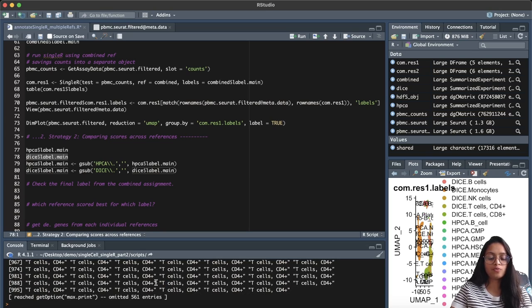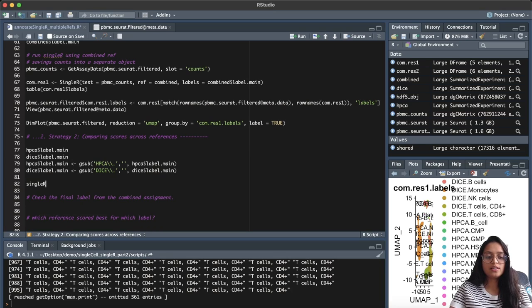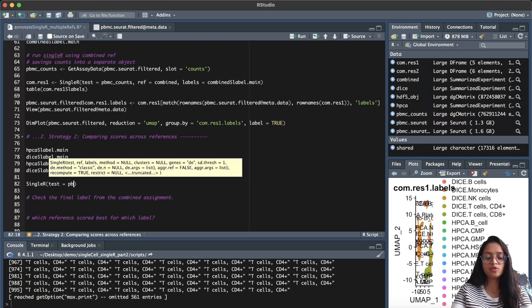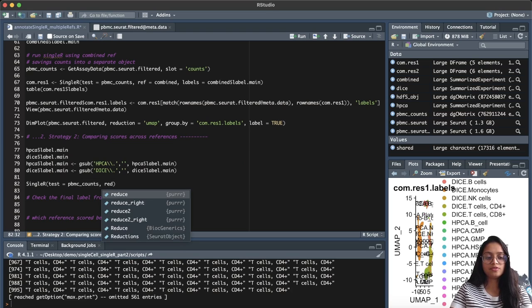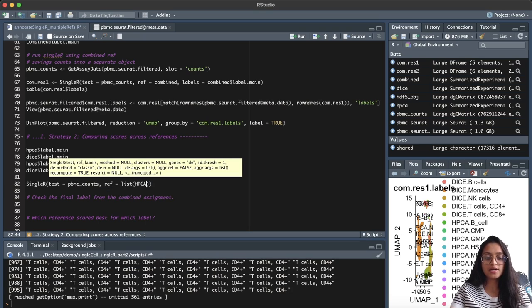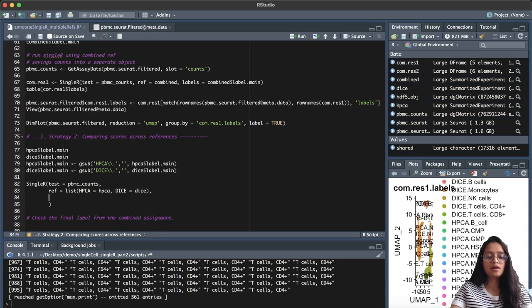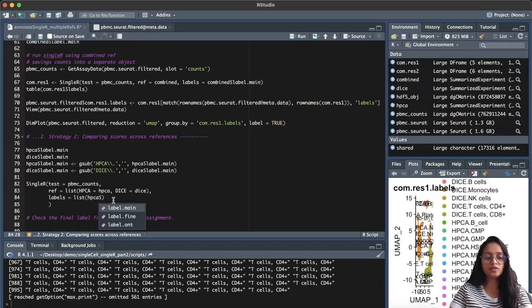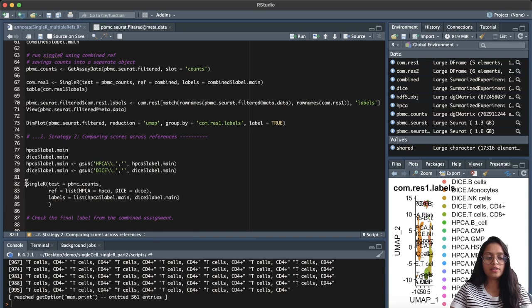Ensuring we have been able to remove these strings — it looks like they are no longer present. Now we build the SingleR query: the test is pbmc_counts, the reference is a list of references since we are providing multiple references, and the labels parameter is also a list corresponding to the order of the references provided. We store this output into a variable called combined_result_2 and run it.